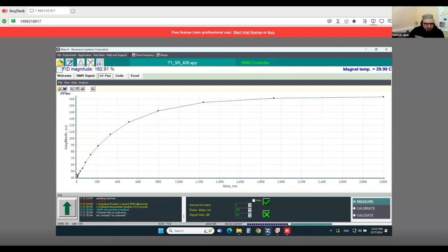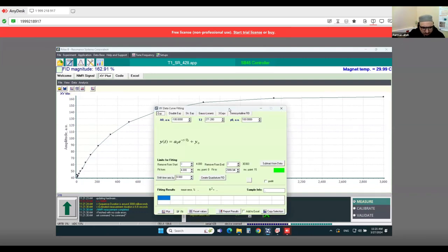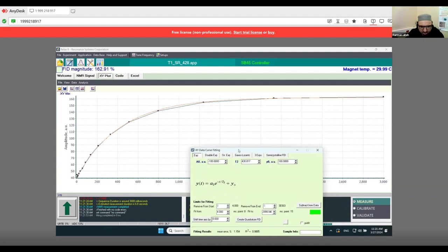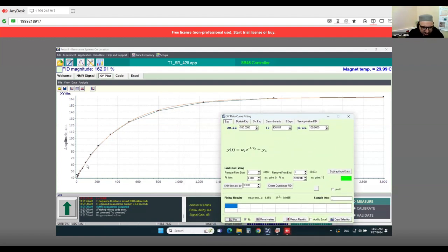Okay, so this is my another result. No, it's working. It's good. So I will apply here different types of functions, which is exponential, meaning mono, double, and other. So I'm starting from the mono. Now you will see how it's fitted: it's diverged, it's not fitting well.